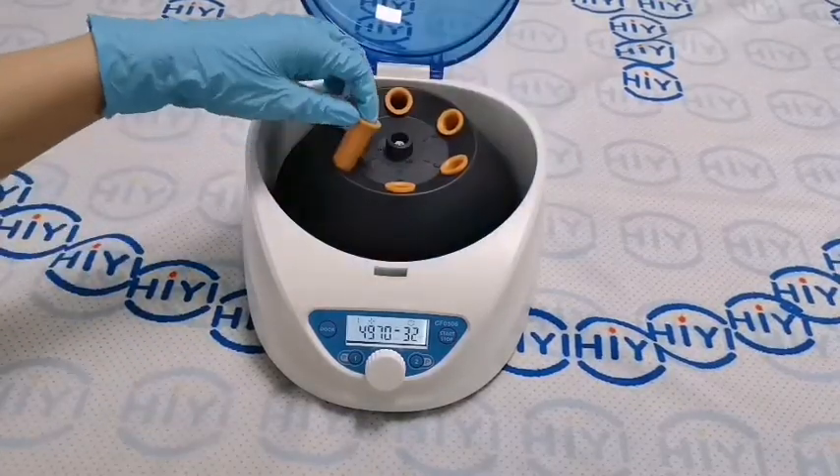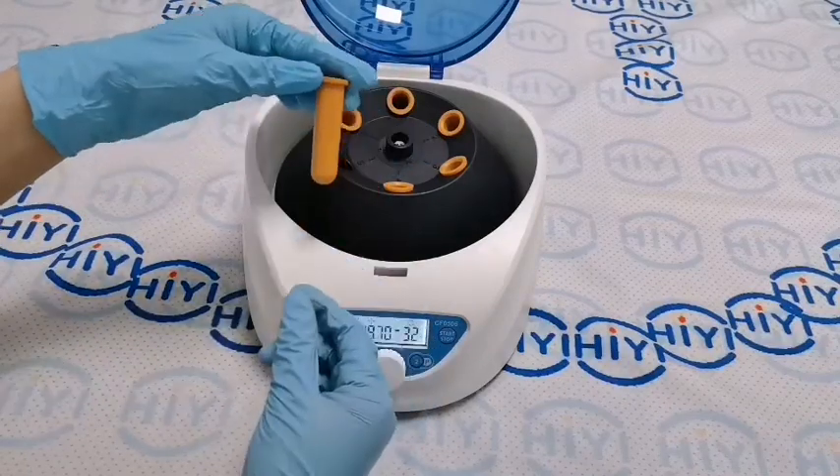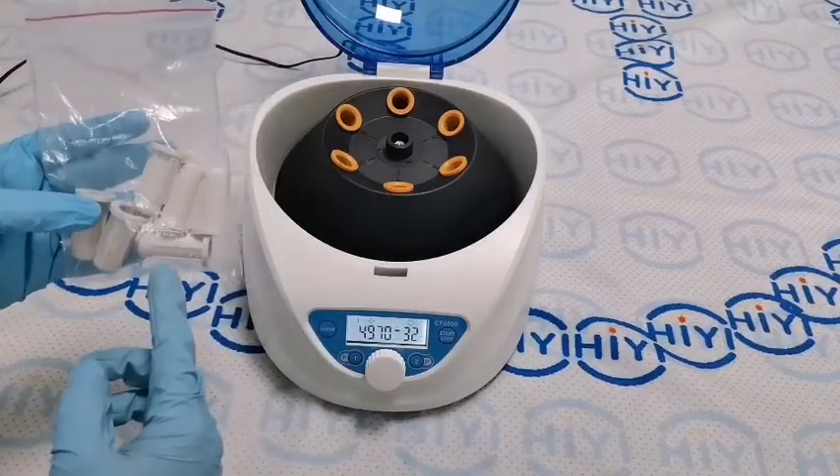It has six adapters. It has two castle adapters. It has long and short — this is short.